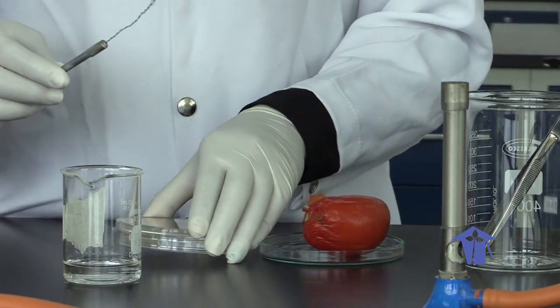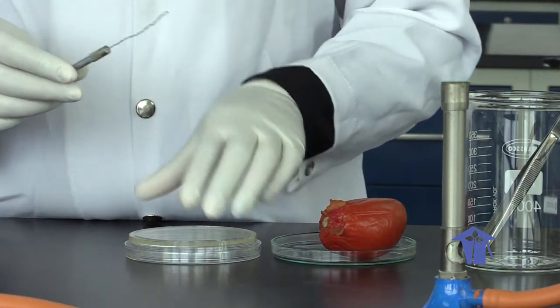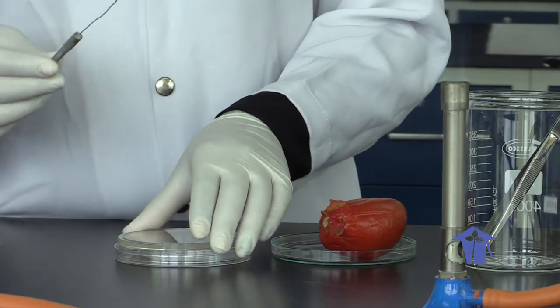So we have our nutrient agar plate here. And if you all remember how to do a quadrant streak, we are streaking in each of the 4 quadrants of that plate.